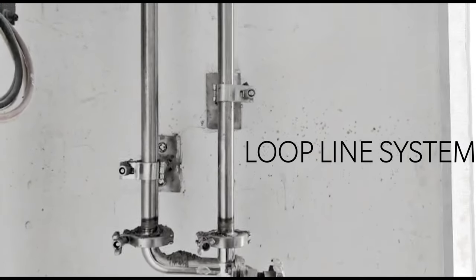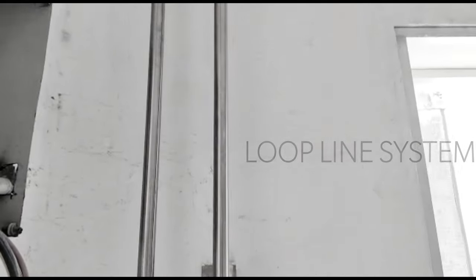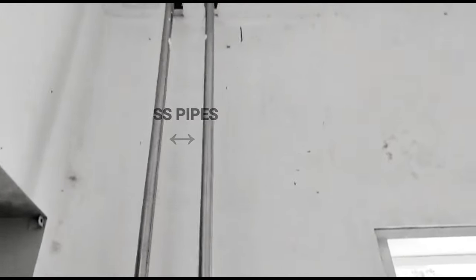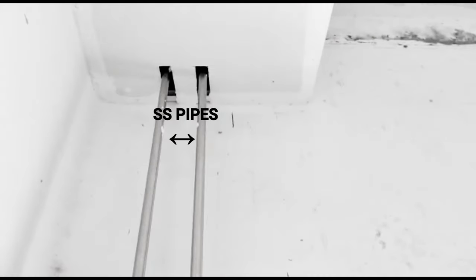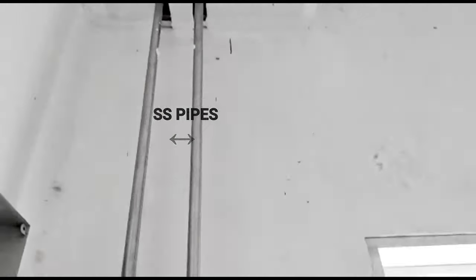Today we are going to talk about the loop line system which is used for water distribution in pharmaceutical industry. Here you can see two stainless steel pipes, one of which is used for inlet and the other for outlet.